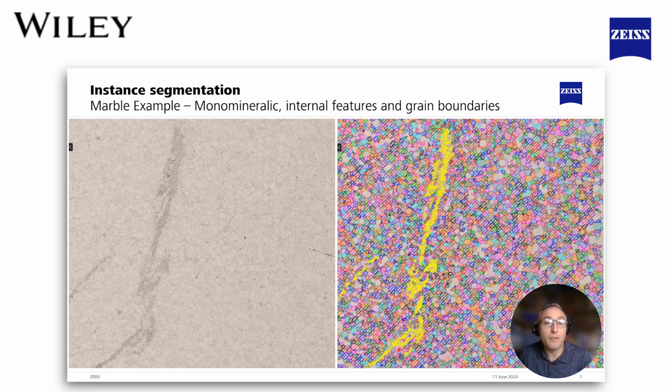These are still calcite, and we can see in the original thin section image, they're a finer grained region of calcite running through the middle of the thin section here. And I've actually told the training model that once we're below a certain grain size, I don't want to include them in my analysis. And again, this is a really interesting feature because I wouldn't be able to do this with semantic segmentation. Once I defined the pixel colors in a semantic segmentation that made up calcite as a classification, it would include all of those pixels as calcite.